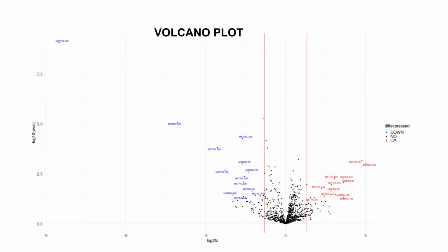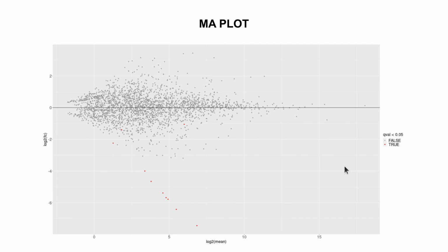and then do the interpretation better. Let's look at the next figure, which is the MA plots. MA plots are also 2D scatter plots. They are used to visualize gene expression data and also identify changes in gene expressions between two conditions. This plot here represents the transcripts. With MA plots, you have the log2 of the means of the normalized read counts on the x-axis, and then on the y-axis we have the log2 fold changes. And by setting a threshold, you'll be able to identify those genes or transcripts that have been significantly expressed. So that is what you need to know.